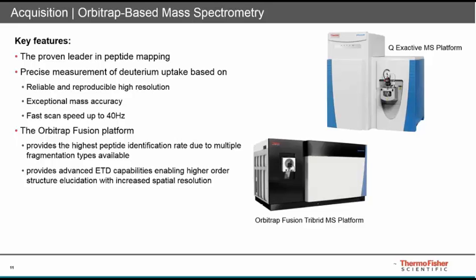But for the entire experimental setup, there's one experiment or data point required that includes to run the sample through the entire setup once, but skipping the labeling step.